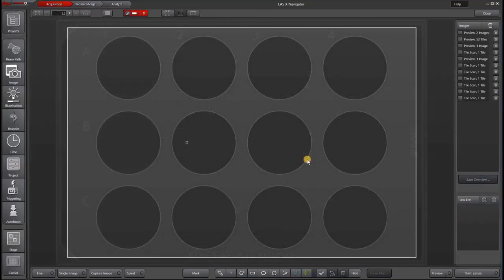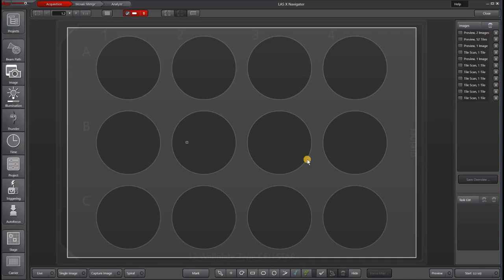One new feature, starting with LAS X 3.6 Navigator, is the on-demand autofocus points. So in addition to all the options that I've listed or talked about under the stage experiment button, you can now also tell Navigator where to run autofocus.